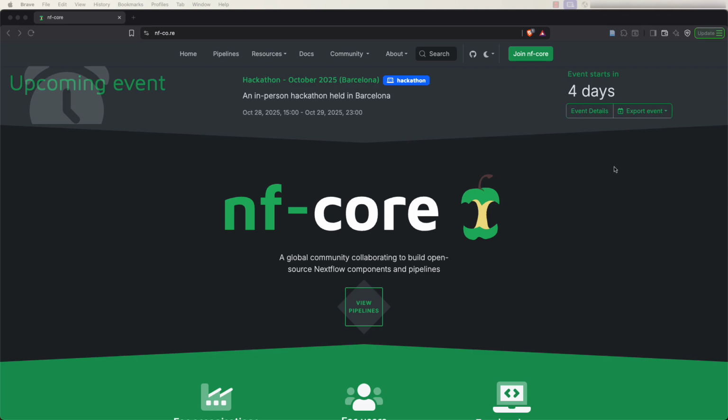NFCore is a global community of scientists, engineers, and students building open source, standardized bioinformatic pipelines that anyone can use. And there are currently over 100 pipelines covering many types of analyses, from genomics to proteomics to metagenomics. So let's take a look at how to explore them.